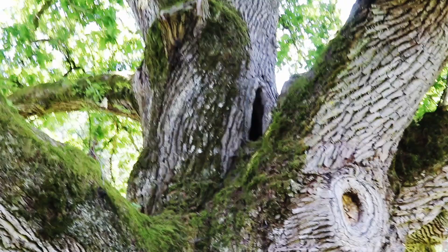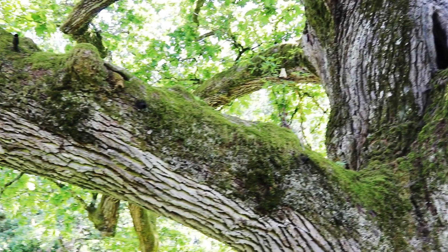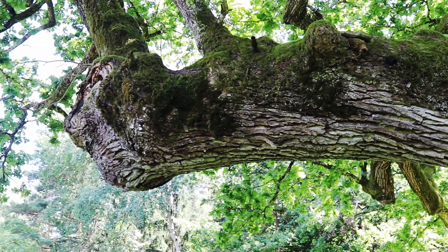In this video, this is the story of how I've done that. Let me quickly show you some proof that I was successful, because this here is the cross section of a small tree branch that I found. Maybe it's indeed the first time ever that we're able to see those cells under the microscope. In my view there's something almost philosophical about this - looking at the cells of one of the largest and oldest organisms. I think that's quite fascinating.